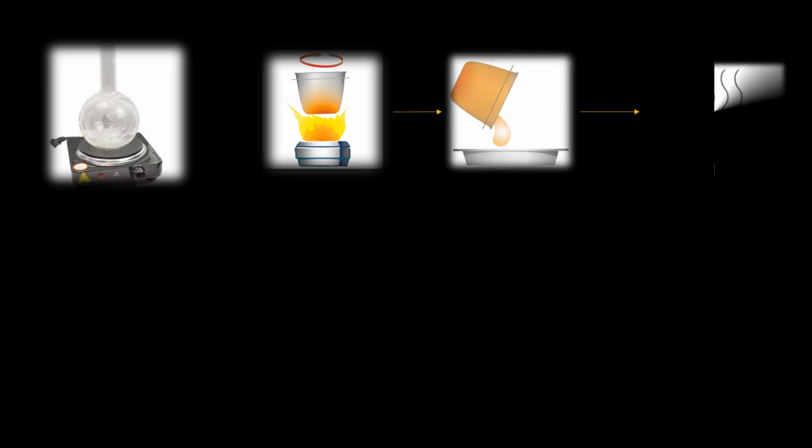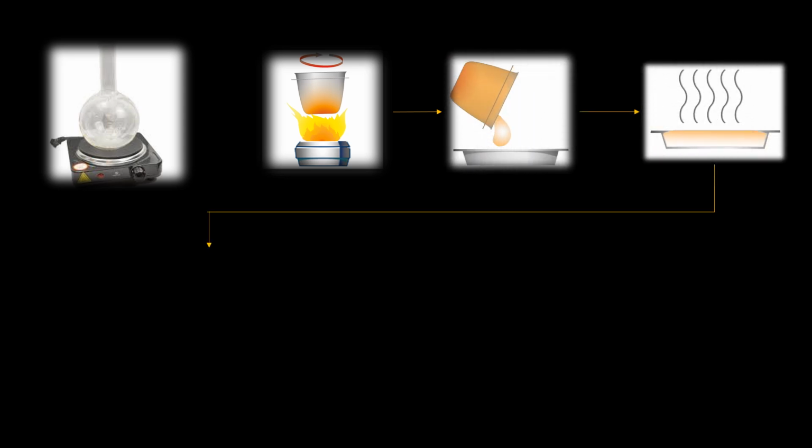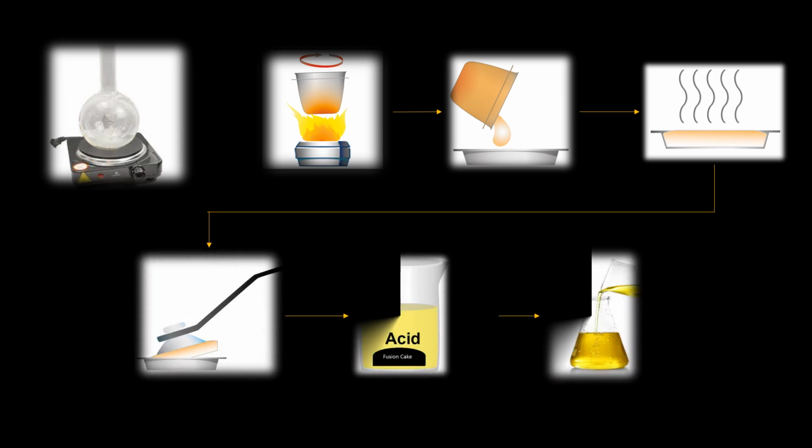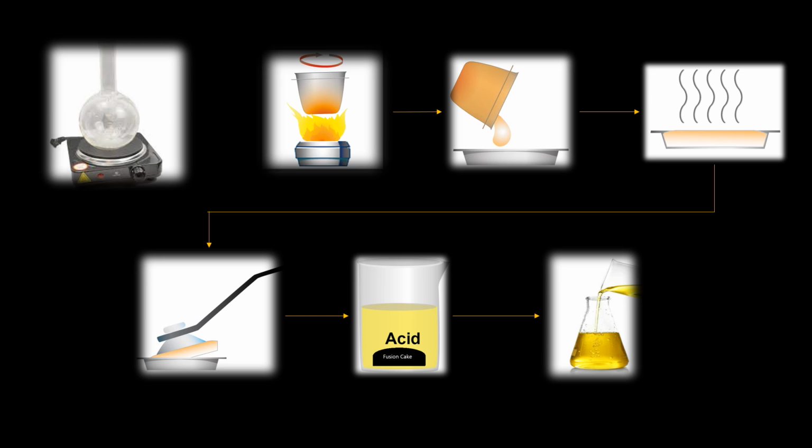However, when it comes to refractory type materials or samples that resist dissolvement, a wet-dry system is usually employed. This consists of melting the sample with an added flux, then pouring it into a disc mold, cooling the disc, and placing it into an acid bath to fully dissolve the fusion cake. There are very few silicates that are water soluble. This wet-dry method may be utilized to break down those chemical bonds that form the crystalline structures of the sample material.